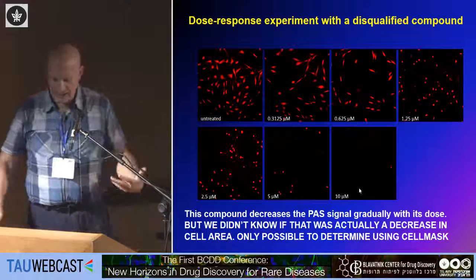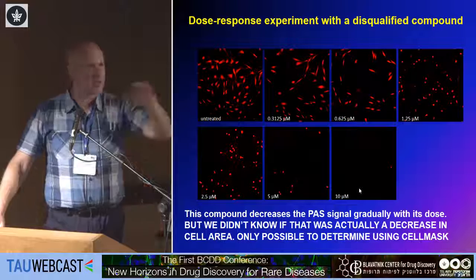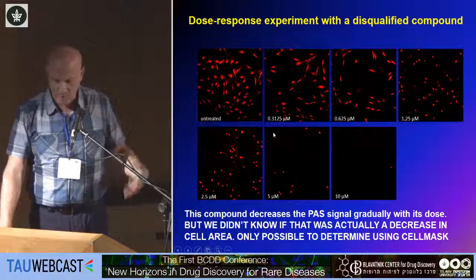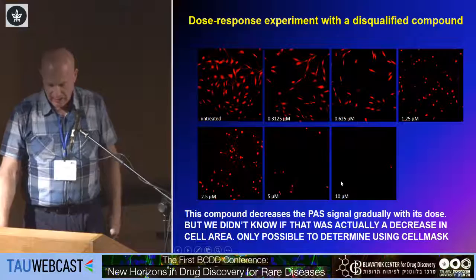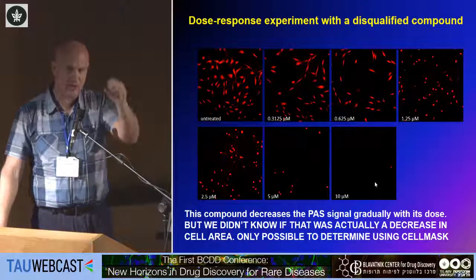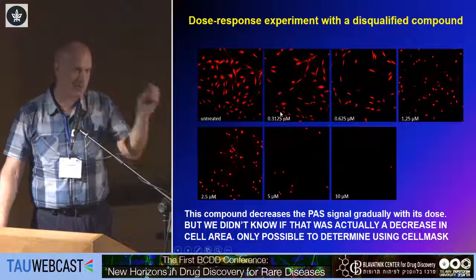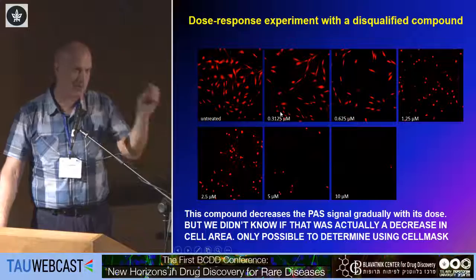A very good example of a false positive: we screened drugs for their ability to reduce polyglucosans. For one drug, there appeared to be a very nice dose response, as it reduced the staining of polyglucosans. However, this actually showed a reduction in cell area — this compound was cytotoxic. We had to take into consideration the cell mask or cytosol staining to see that the compound was simply reducing cell size.